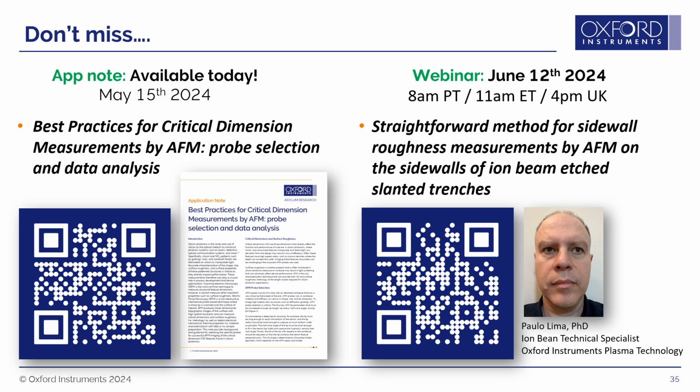Okay. And another question, could you please elaborate on the force constant choice? I'm assuming it's the spring constant.